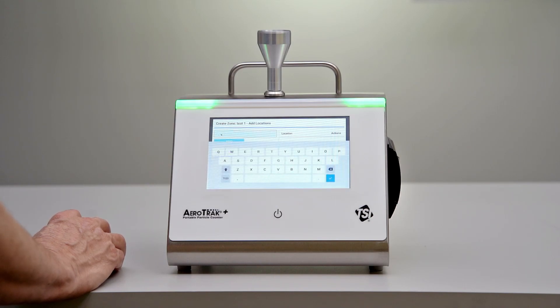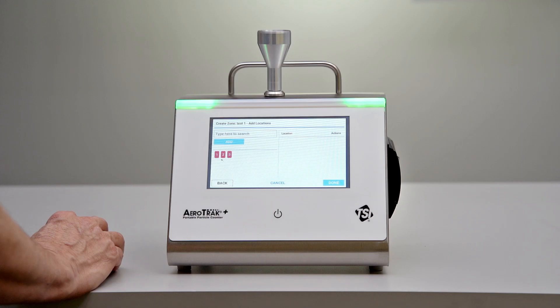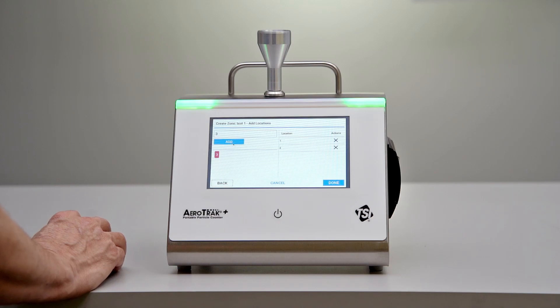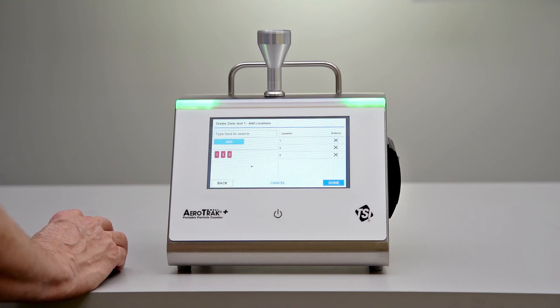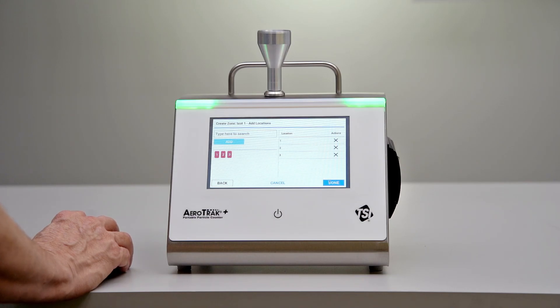We can program both at-rest and operational limits here, depending on what your SOP says. After that, we just have to identify the number of locations to add. I'm going to pull in these pre-existing locations from the memory of the unit to have a few locations in our program. You can type in whatever you want and add as many or as few locations as you need for your SOP.